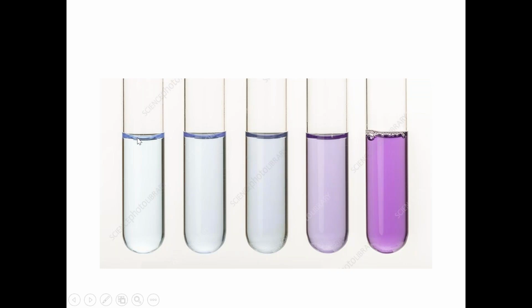I have told you the intensity of the color depends on the concentration of the protein present in the solution. Here this is the blank, and after that the two are almost similar. See the difference between these three test tubes, 1, 2, and 3. This is the blank, and compare these two test tubes. This one will have more concentration of protein as compared to this test tube. So after performing your practical, you will get colors like this.